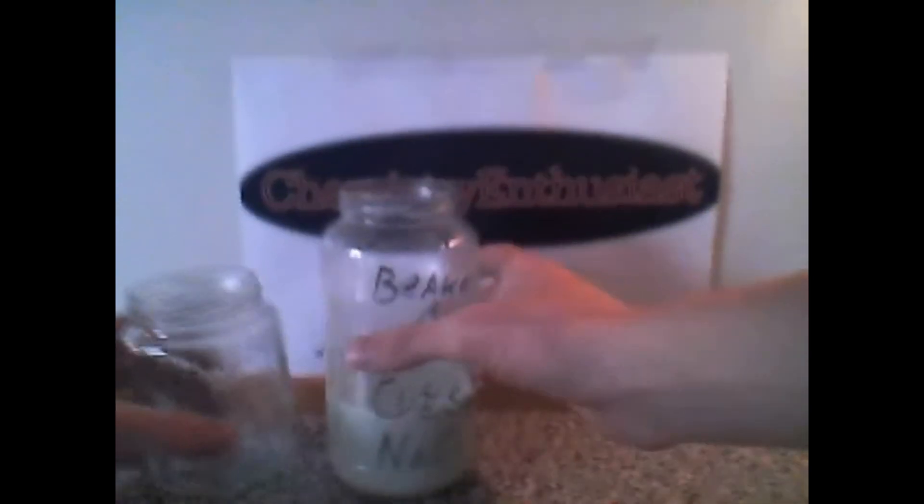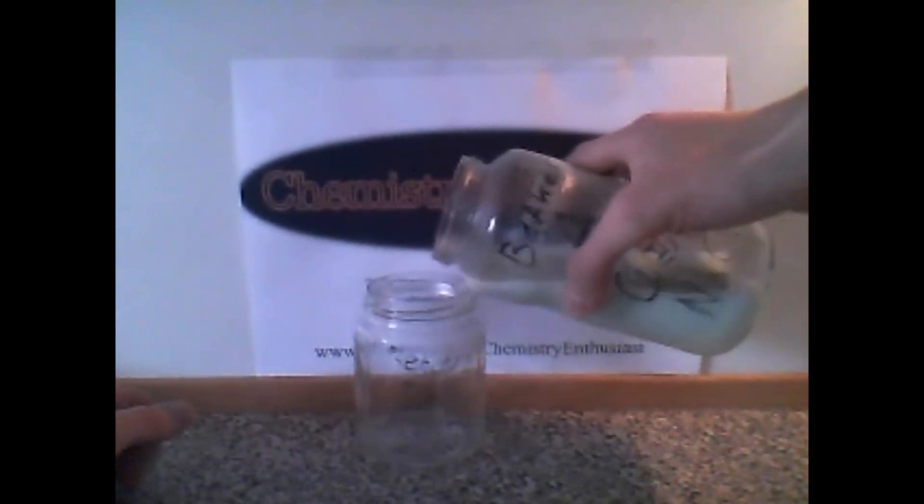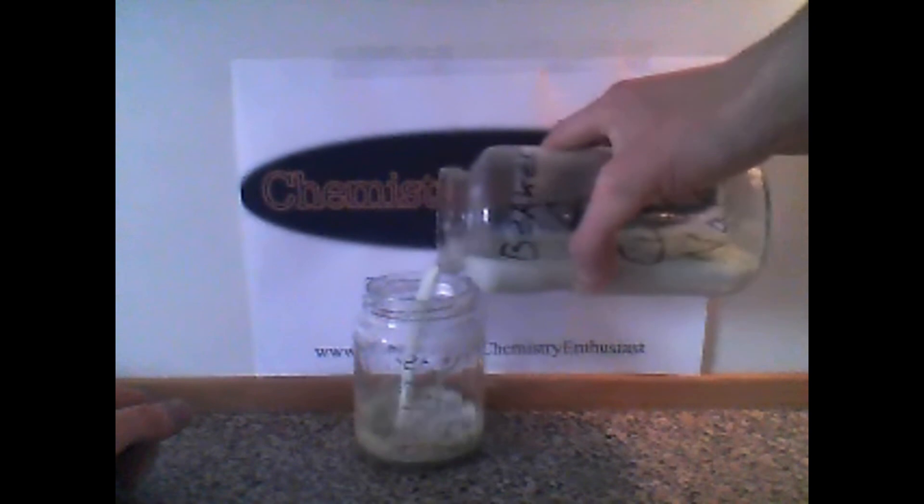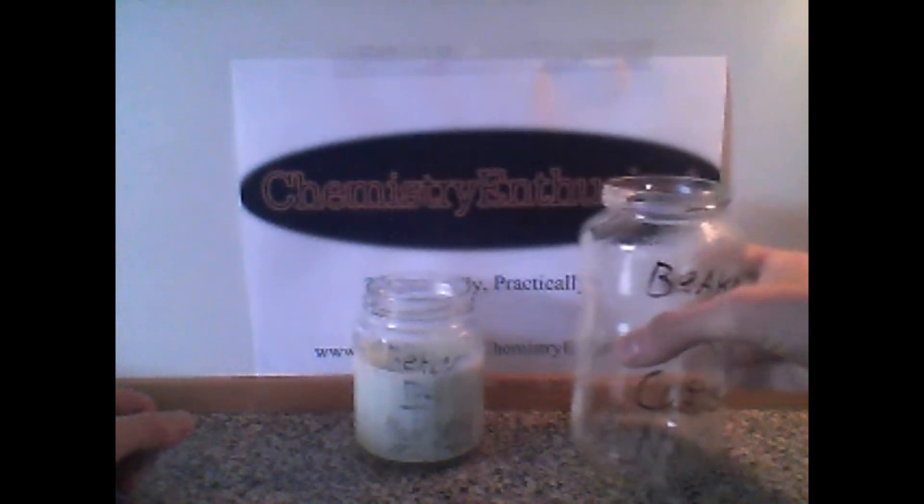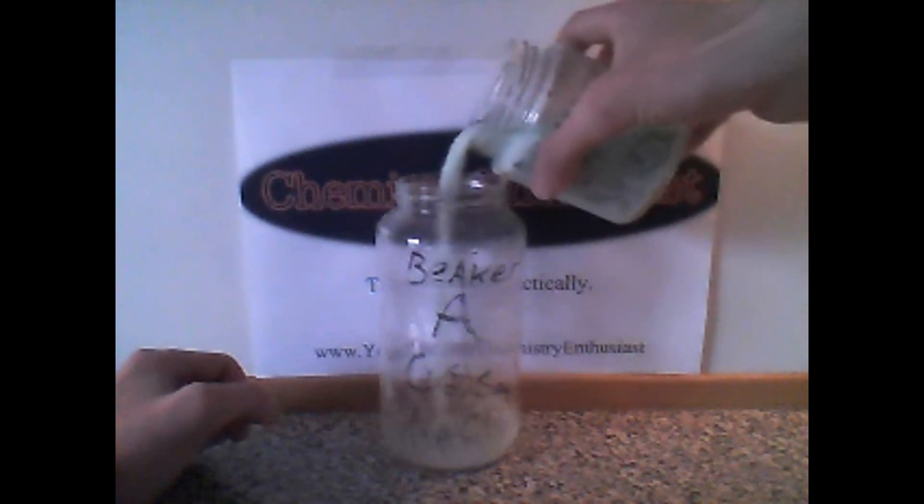And then pour it back into beaker B to get all of the chemicals to react. As you can see the brown color, there was some chemical left in the beaker, so this was a good idea. Now pour it back into beaker A. This will also mix the chemicals completely.